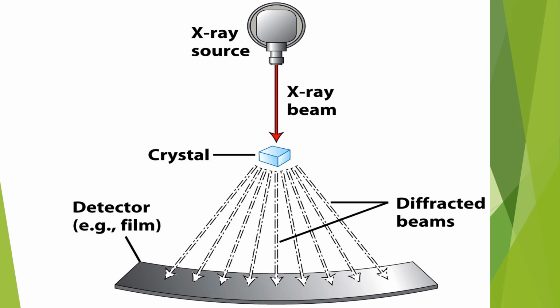Because this crystal is always in a state of rotation, it gives different diffracted beams which can be recorded in a detector or on a film.